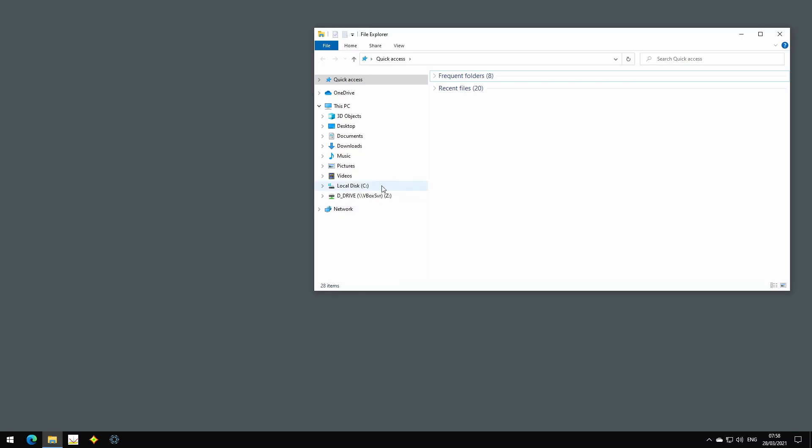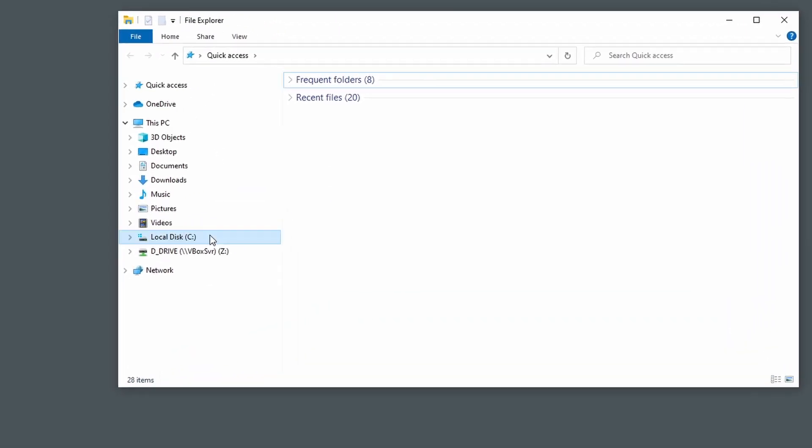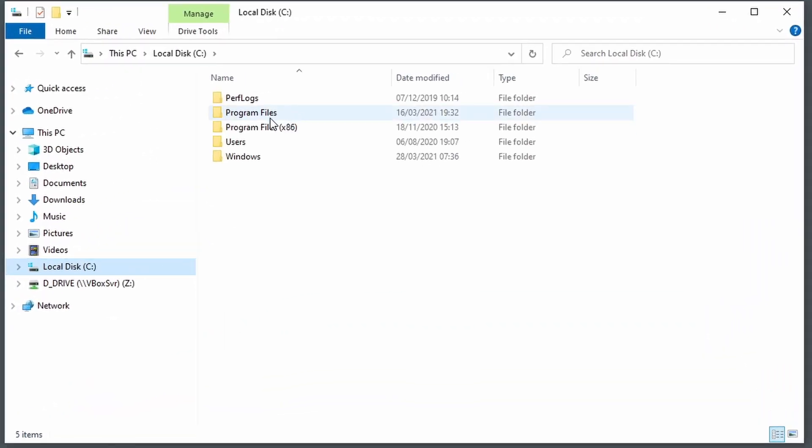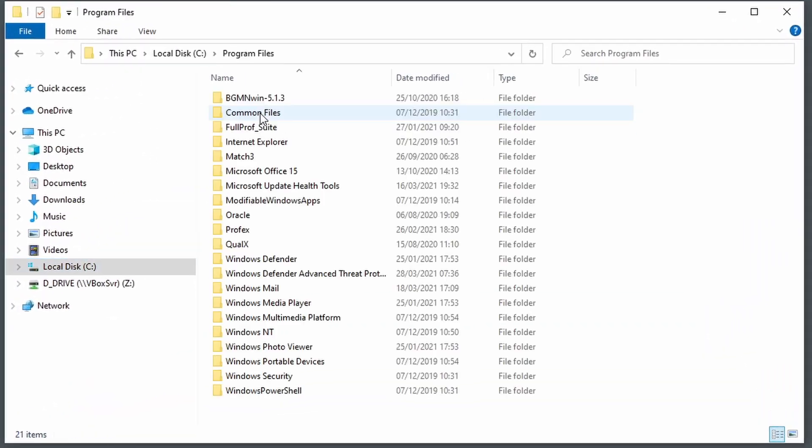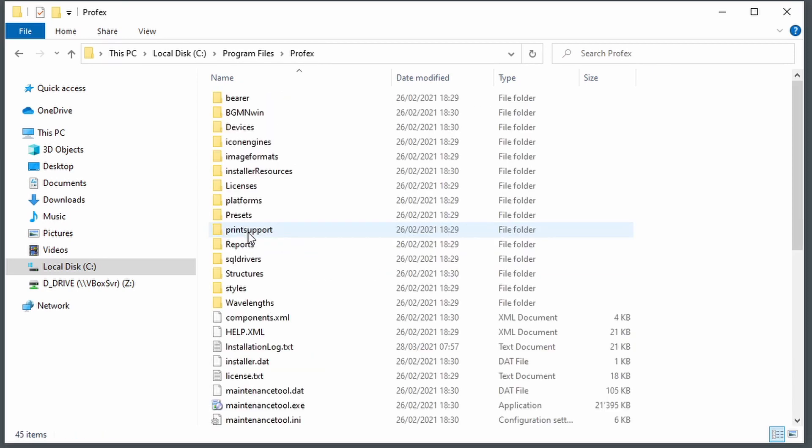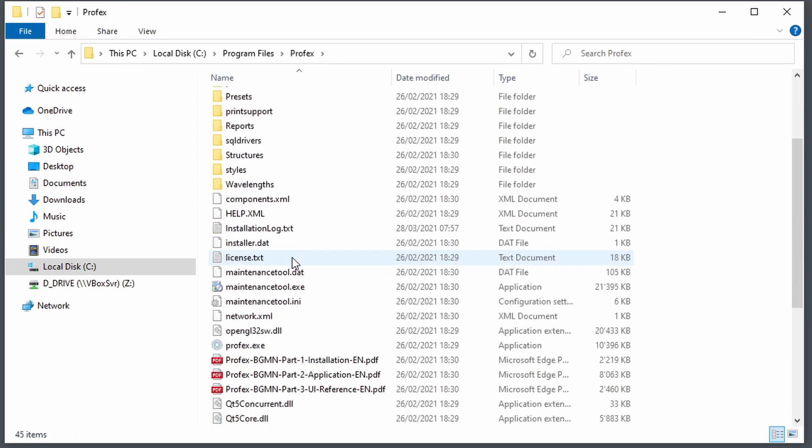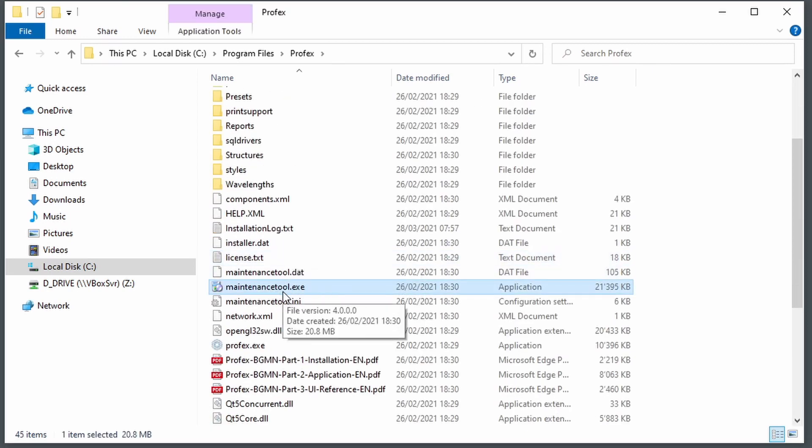To start the upgrade process we first have to go to the Profex installation folder, that's typically on C, Program Files, Profex, and in there we find the maintenance tool application.